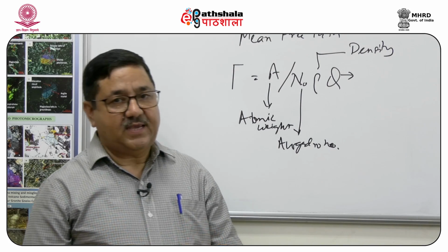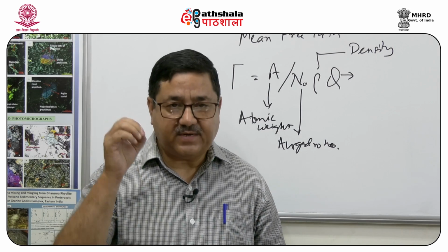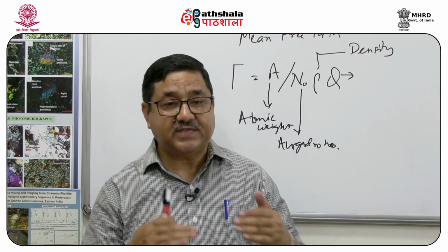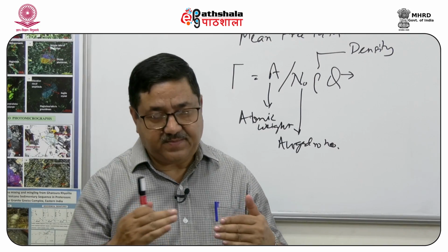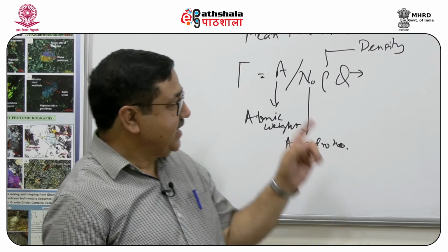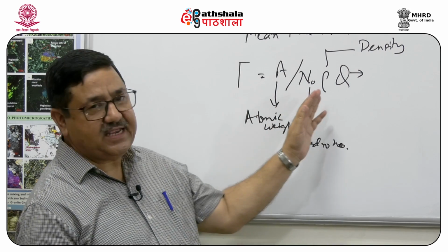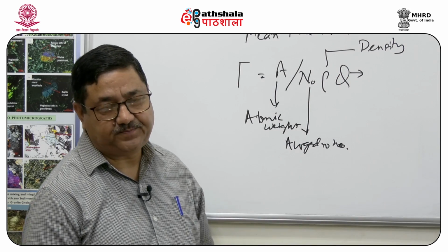Till such time an electron loses all its energy, that is, let us say from 10 kilo electron volts to when it comes to rest or 0, it will pass through several mean free paths, and the average path will be a sum of all these mean free paths. Once we look at this equation, the electron will lose its energy differently in different rho or different density material.